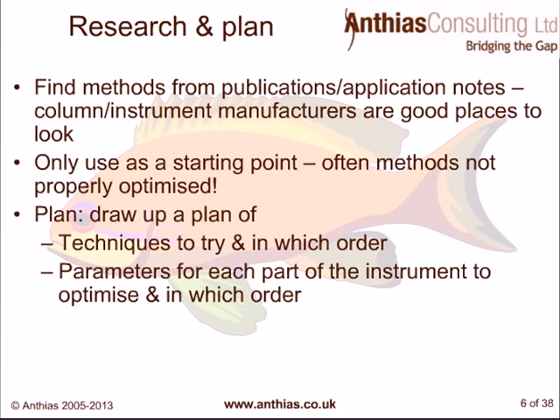time, alongside much of your other work, you can forget where you've got to. You can get lost, particularly for very difficult applications. So if you've drawn up a plan and then you've updated your plan as you've gone along, maybe use a highlighter pen to actually highlight areas that you've tried, ticks, make some notes, etc., then it means that if you're to go away on holiday and to come back, or you get pulled away on a different project, then you can very quickly catch up to where you were without having to go through the data files of all the research that you've actually done and the different parameters and techniques that you've actually tried.